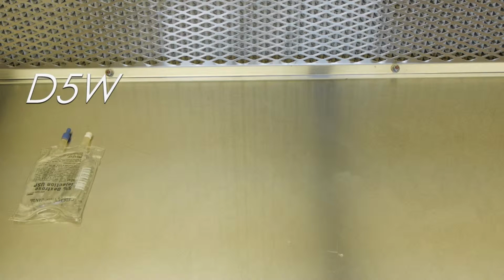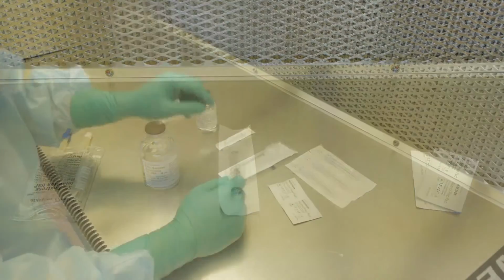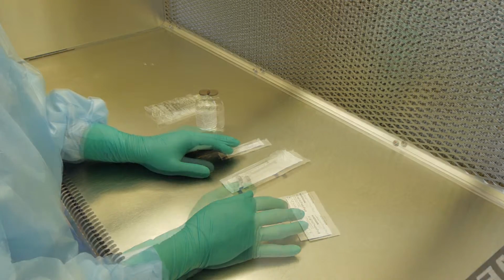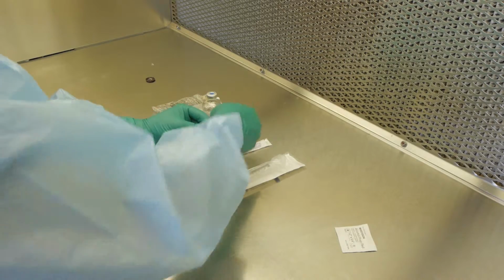First, we'll show you how to do a liquid-to-liquid transfer. You will need the following. When you place the items in the hood, make sure they are side by side so that the airflow is not obstructed, and make sure the ports of the bags are all facing the filter. To begin, remove the caps on all vials and wipe the ports of each item with alcohol.